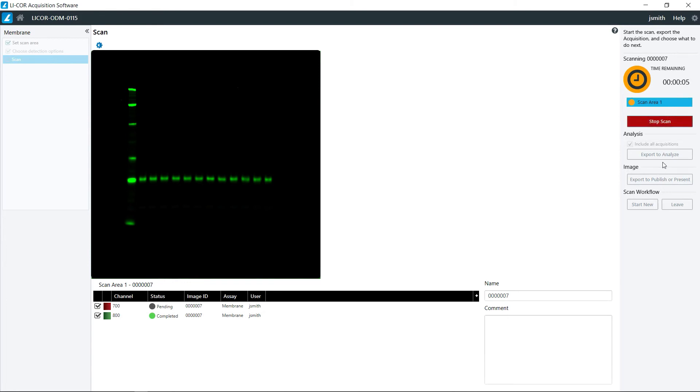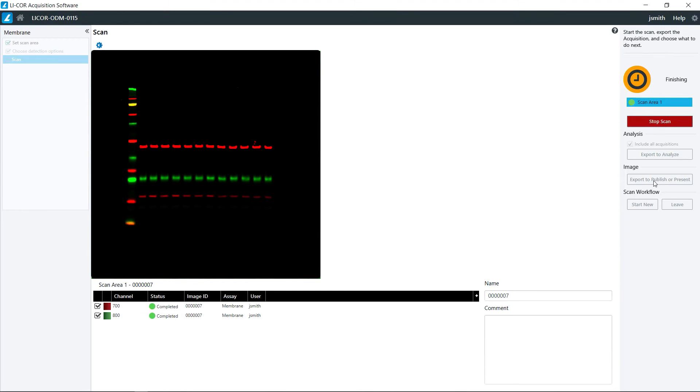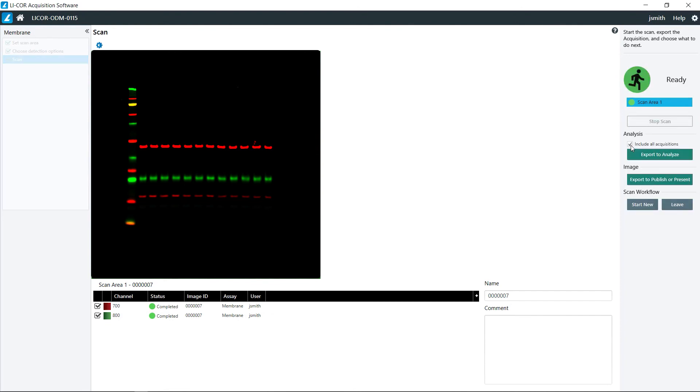Once the scan is completed, we'll have the option to export for analysis in Imperia or export for presentation or publication. We also have the option here if you have scanned multiple areas to export all of the acquisitions into one file for making it easier to transfer, or if you just want to export them individually you uncheck that at that point in time.